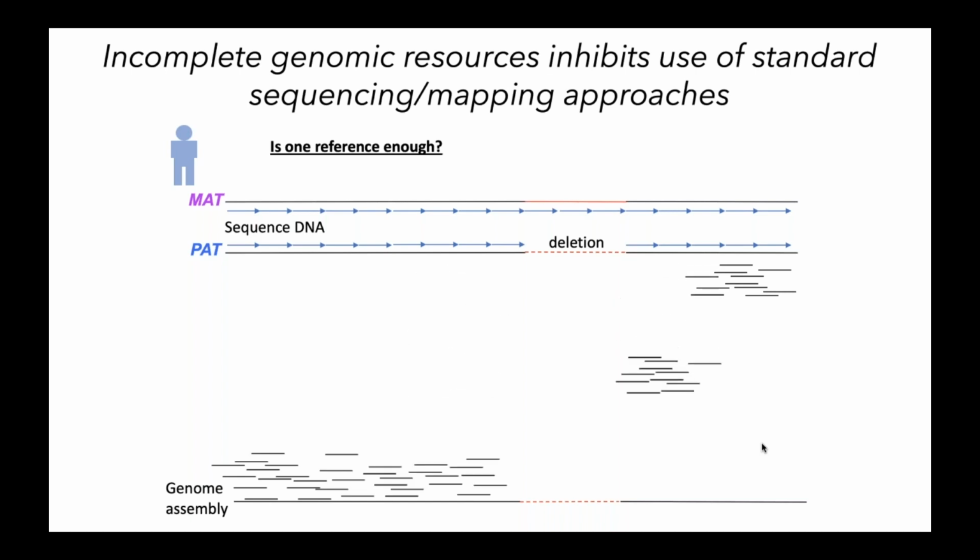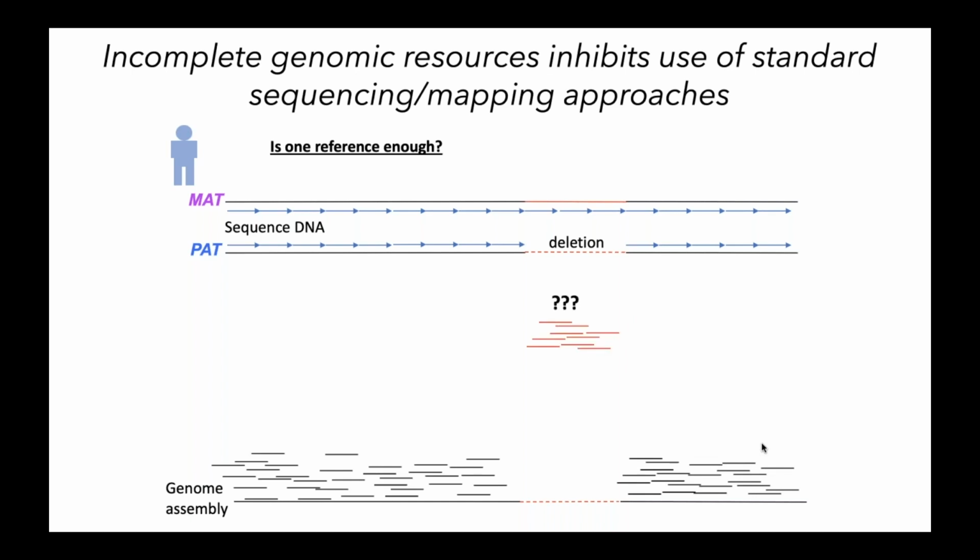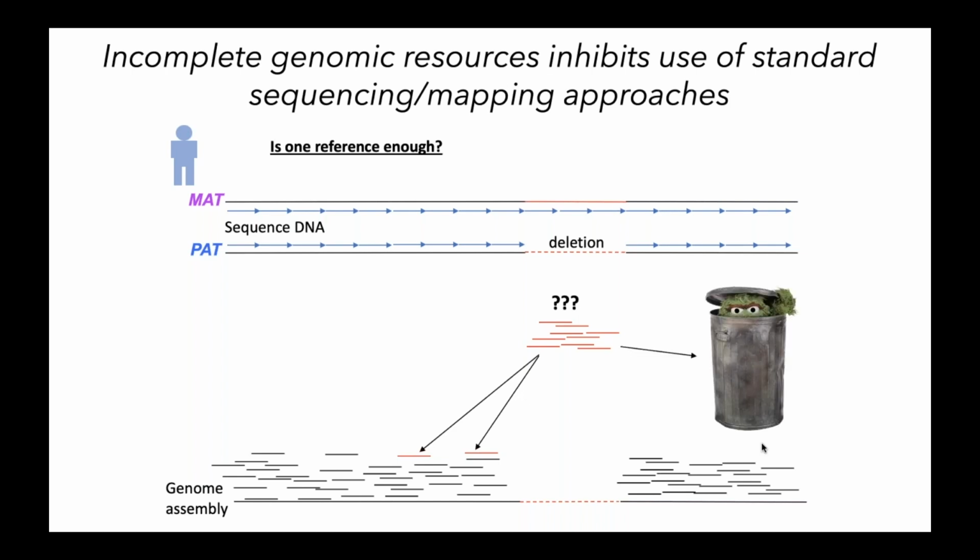In the instance in which there are locations in the reference assembly that match the sample, this is, well, maybe not a trivial exercise, but it's a doable exercise. However, in insertion sequence, we often have a conundrum because these reads will end up getting either mapped incorrectly in the wrong position, or we throw them away entirely and we don't collect any information from that region. And in fact, in IGH, using standard approaches, this is exactly what happens because of all the structural variation.